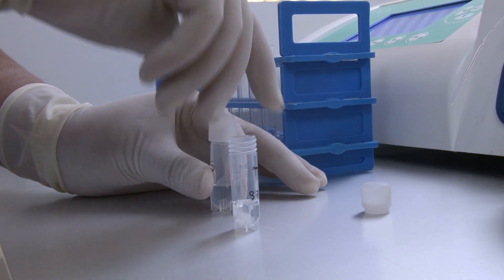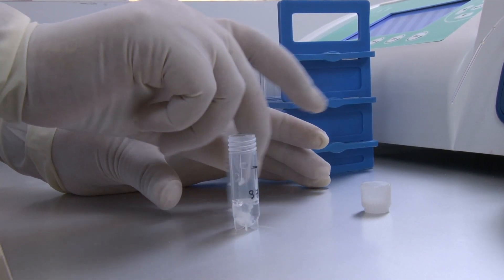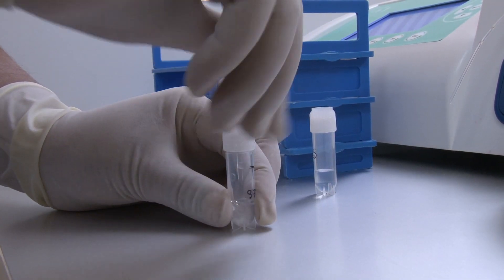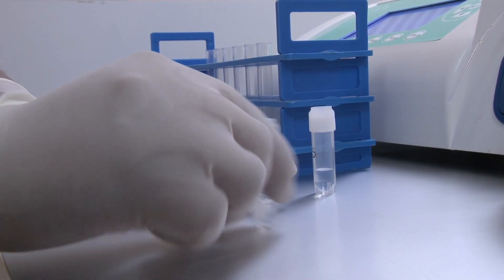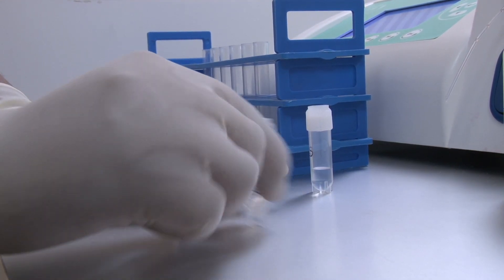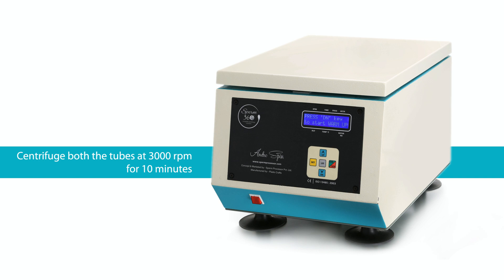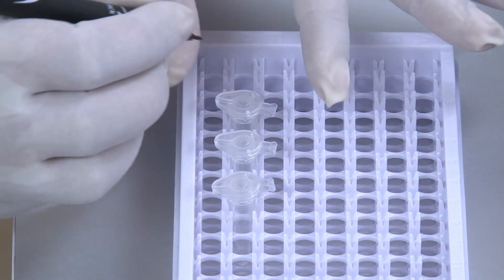Close the tubes with lids and mix them gently. Centrifuge both tubes at 3000 rpm for 10 minutes. Take three micro tubes.